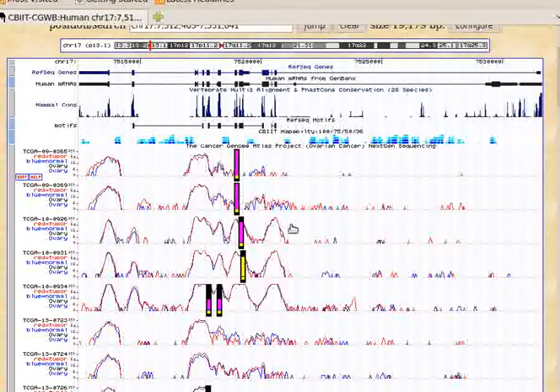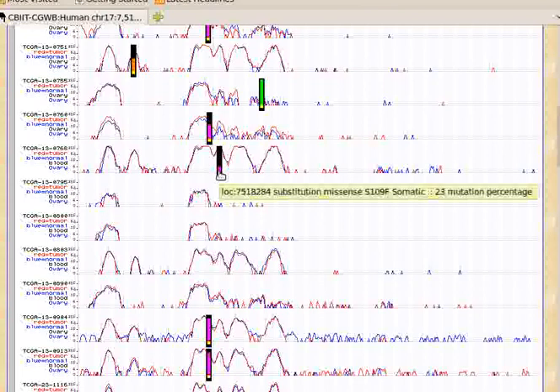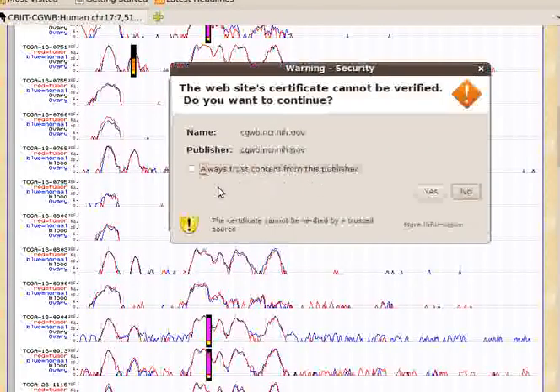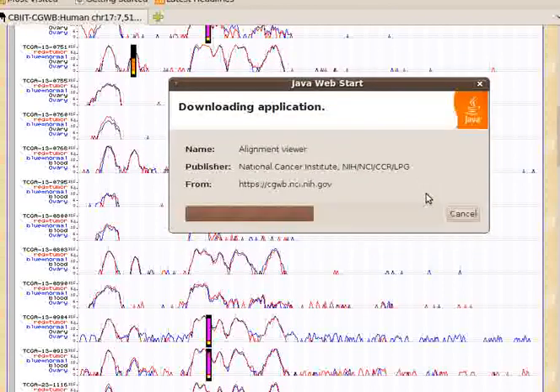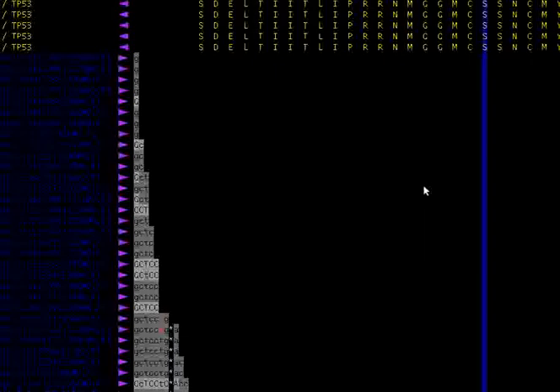And if you're a user who has logged in, you can actually view the next-gen sequencing data, looking at the alignment view generated from the BAM files of next-generation sequencing data. I'll use an example by clicking over here. And don't worry, you can always trust this. It will create a picture that centers around where the mutation allele is.